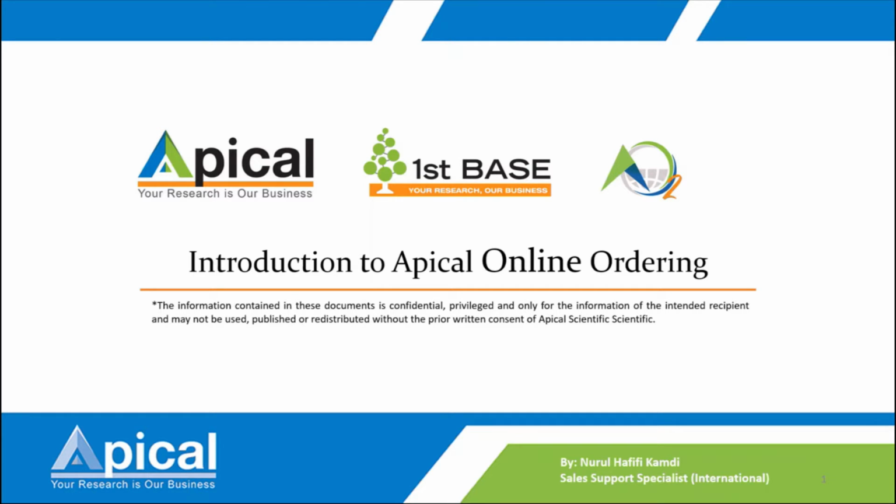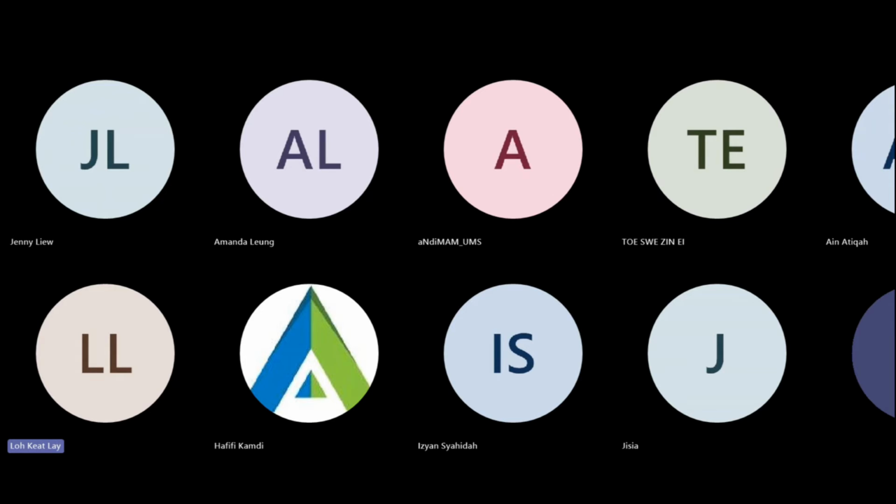I have a question. What is the advantage of sequencing a PCR product? You need to get the sequence in your PCR product. After you run a PCR, you get a product from your target gene. Then after you run a gel, you know the size only. You won't know what the sequence inside is. So you send it for sequencing to know what the sequence is.